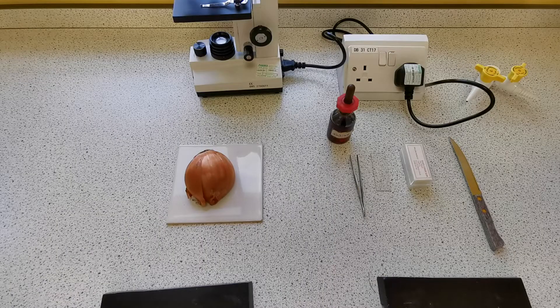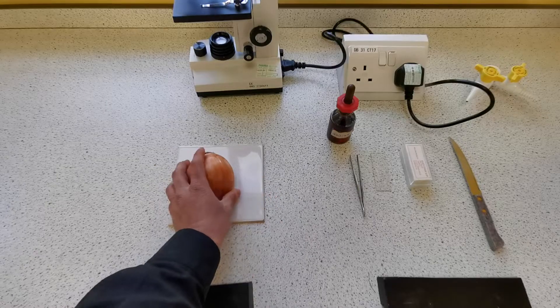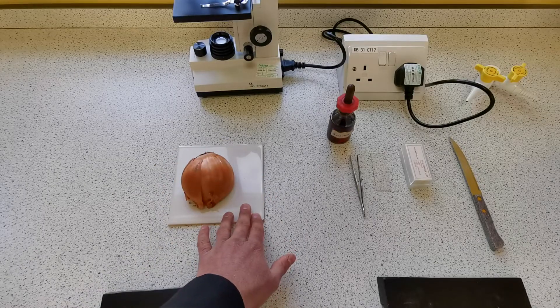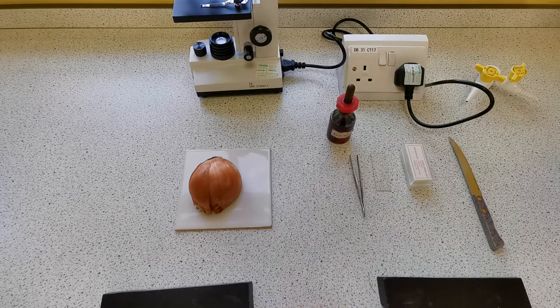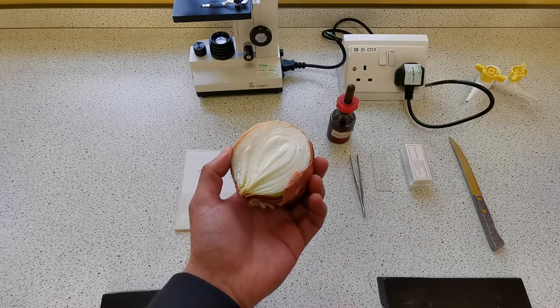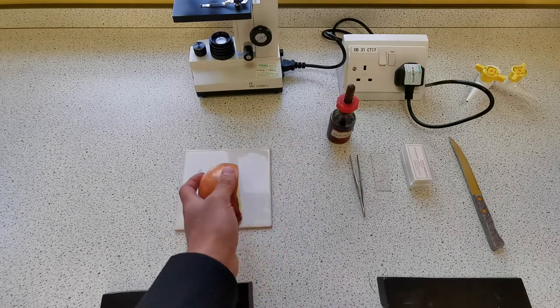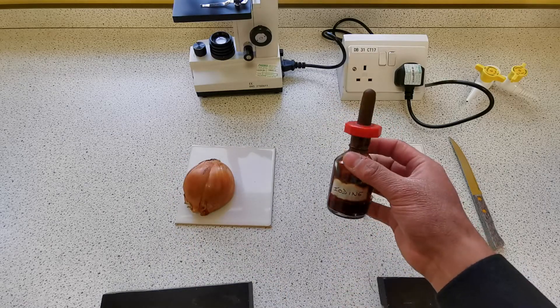To prepare the slide of the onion sample, we've got some onion on a white tile that we use to cut. We've got some iodine which we use to stain the onion cells, as onion doesn't really have a colour — the cells are transparent. So to see them more clearly we use iodine to stain the cells and add colour to them.